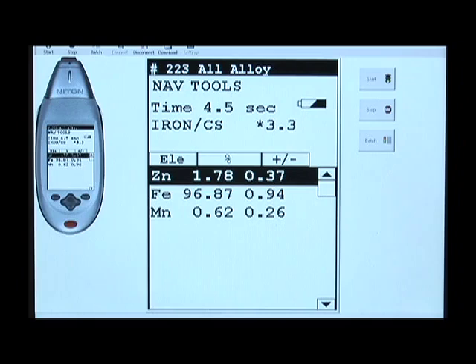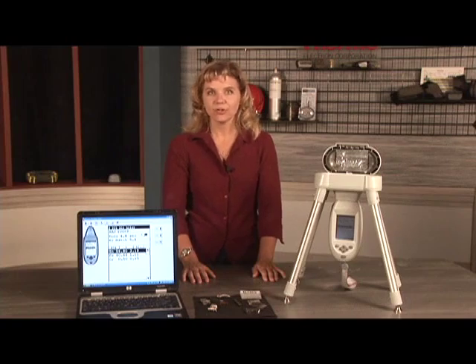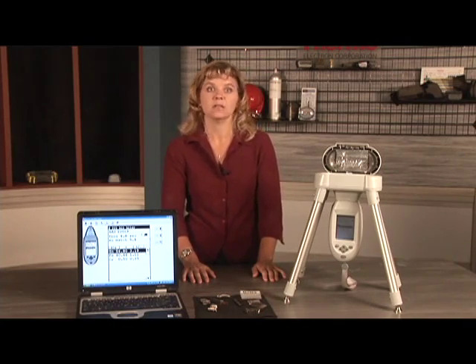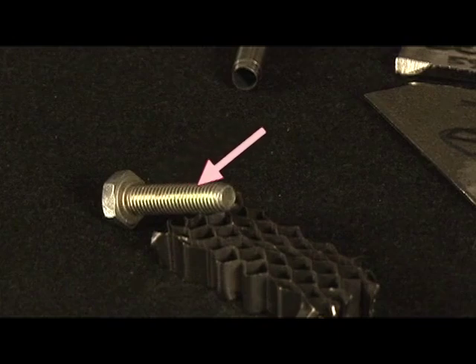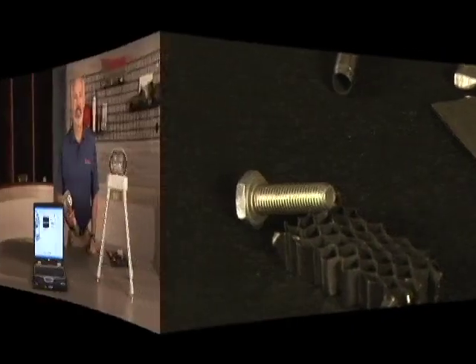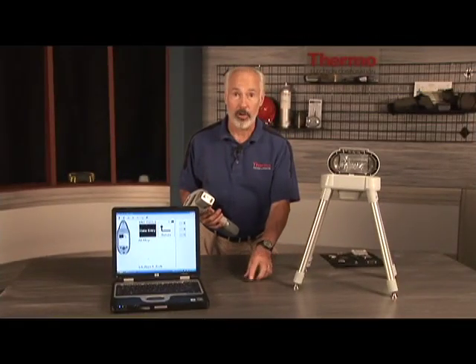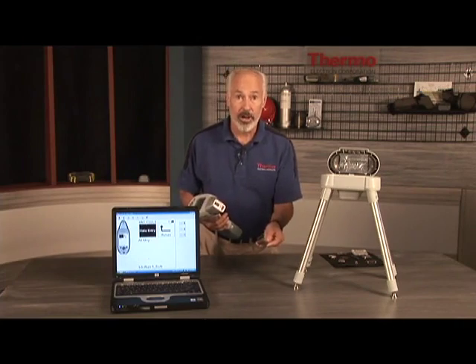The alert alloy sorter will know that the steel alloys don't contain zinc. Therefore, the conclusion is that it must be coated and we should grind the sample prior to its analysis. We can also notice a slightly off-color yellowish tint to the coated area that is not typical of a clean steel surface. Another example is measuring this shot-blasted titanium alloy with and without grinding.